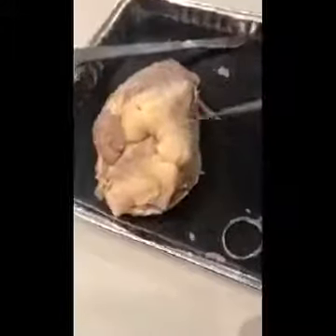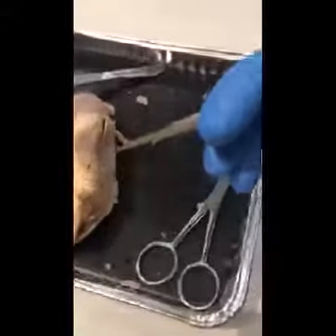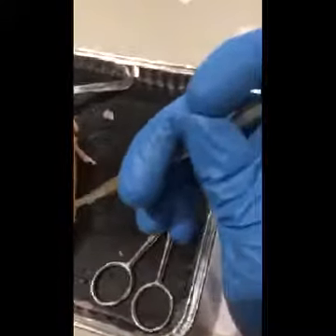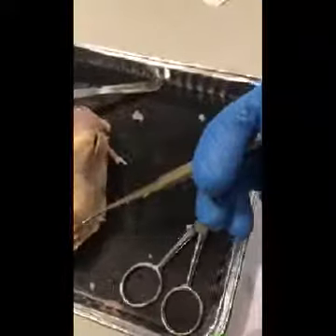We have the coronary artery, and it is the artery that comes from the aorta that supplies blood to the heart muscle.